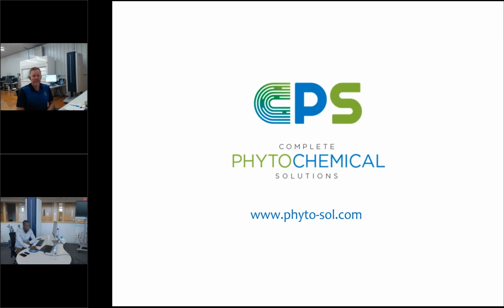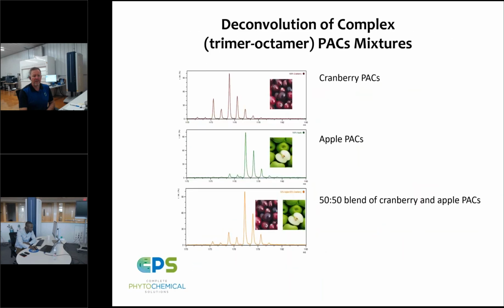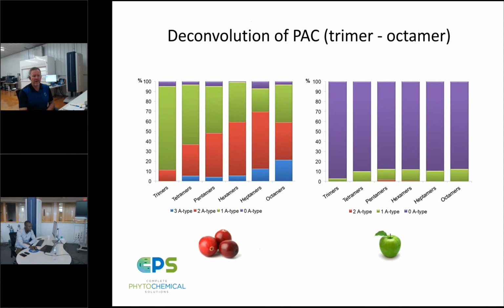Thank you, Chris. Second question: on your first slide, the axes of the graph are cranberry percent predicted and percent measured. Do these refer to the concentration of PACs measured in the sample? On the first slide, this was the predicted versus expected. Is that the question, Pierre? I believe that's the slide in question.